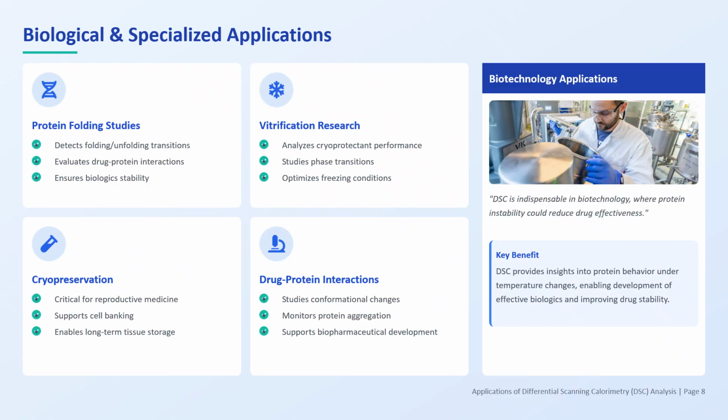In biotechnology, DSC becomes a tool for protecting protein integrity. Proteins are sensitive molecules. Even small unfolding events can reduce drug effectiveness. DSC detects protein folding and unfolding transitions, evaluates drug-protein interactions, and monitors aggregation risks. In vitrification and cryopreservation, DSC helps optimize freezing conditions for cells, tissues, and reproductive materials. For biologics and advanced therapies, DSC provides insights that directly impact efficacy, stability, and patient safety.